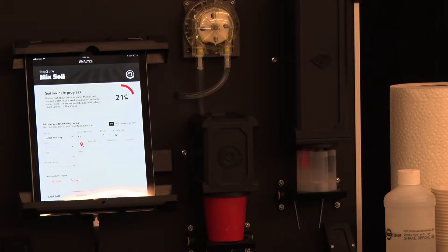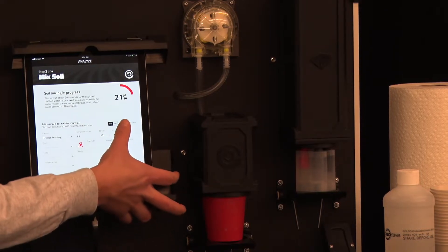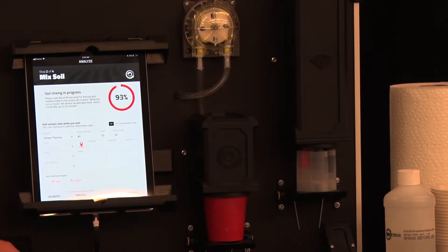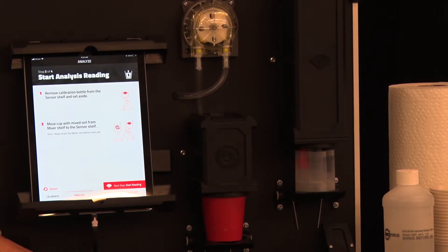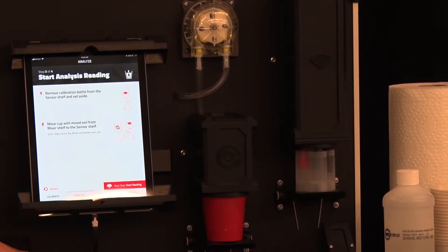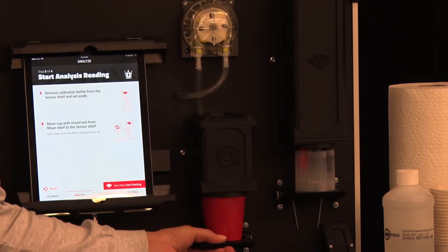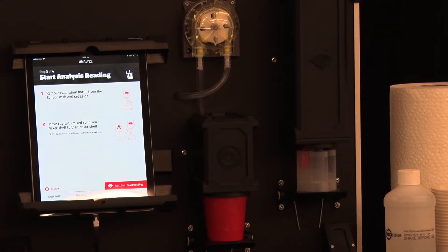If you have hard soil you may want to use the extended mix time function just by selecting on. This will allow the mixer additional time to mix the soil with the distilled water to make a slurry. When the mixer has completed mixing the next page will say start reading.